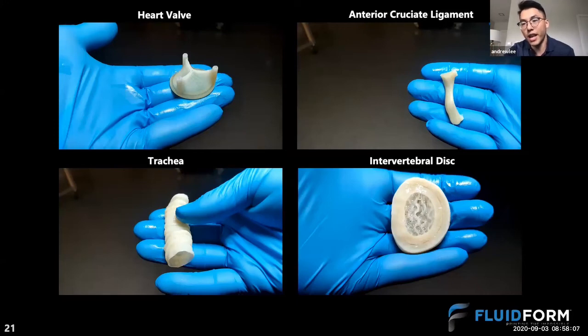And then at the very end, you just raise the temperature on a platform or put it on a hot plate that's around 37 degrees Celsius to melt away that gelatin. And then you're left with a cross-linked or gelled structure that you've designed and created and printed.